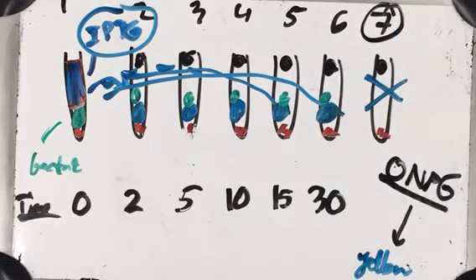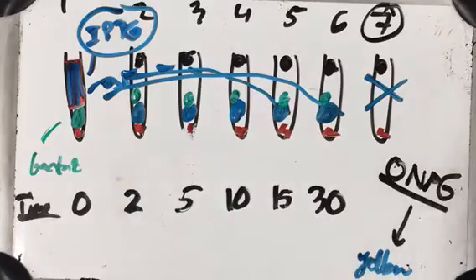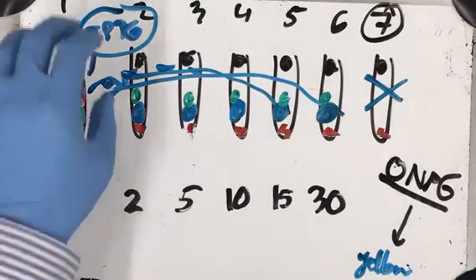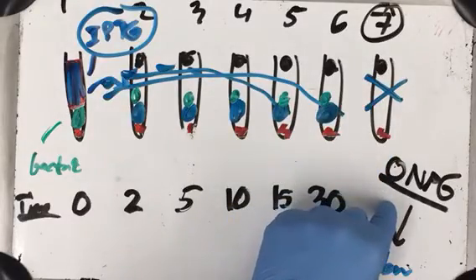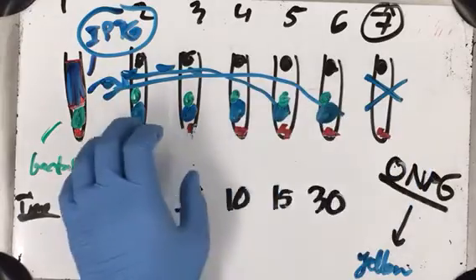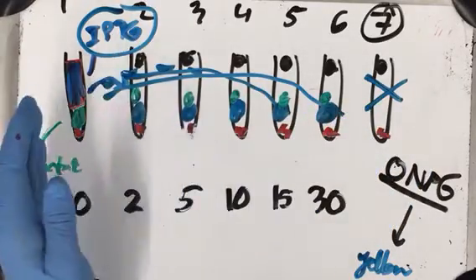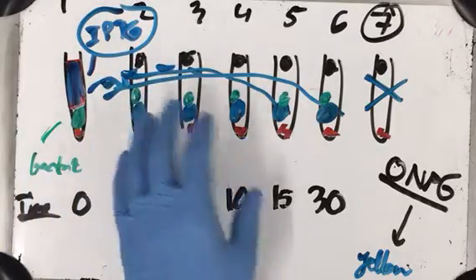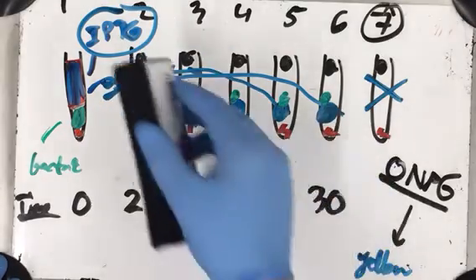So with this in mind, we can have a string of time amounts after we've added the inducer to activate the gene. Then we add in ONPG, which will get degraded. Because everything should be active after adding this, we're going to see at what time point the max gene expression has happened. And that should give us a clue about how quickly these things can turn on and off in response to very little stimulus.